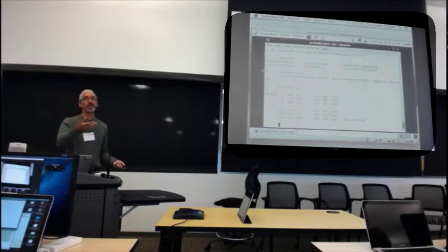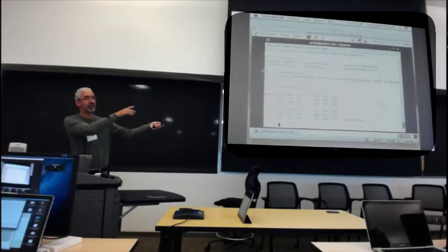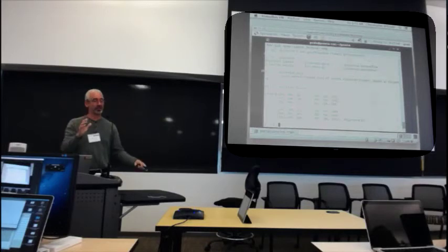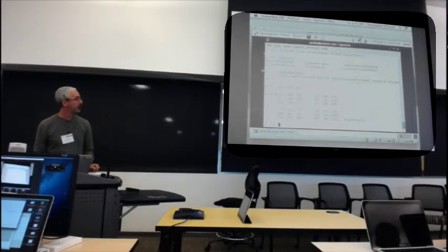And you can do that with the eBeam BLD, so you can figure out here how the LCLS data works and what routines to put into your little script, what calls, to go get the raw data with at least minimal reading of documentation, or just a few lines. Okay.